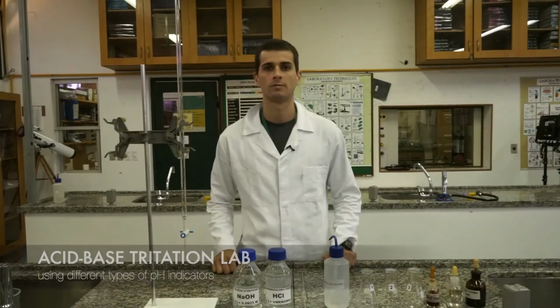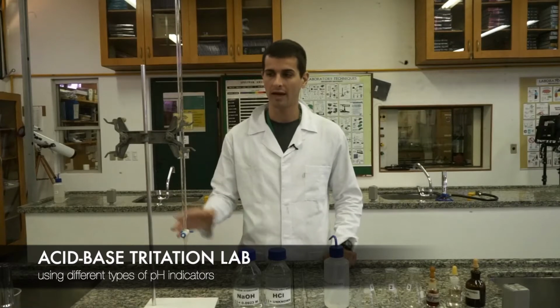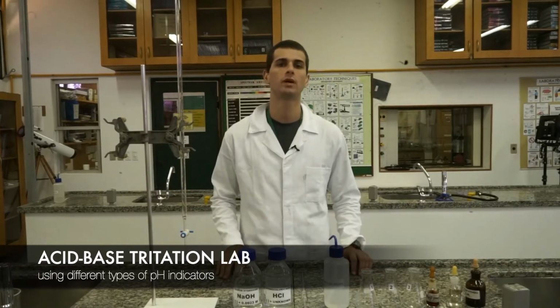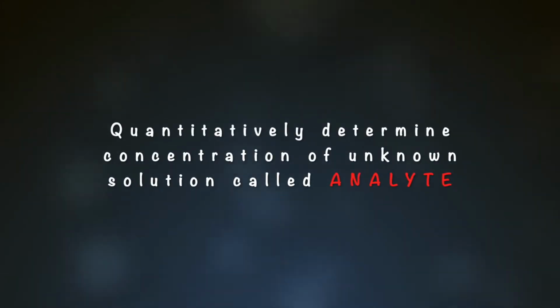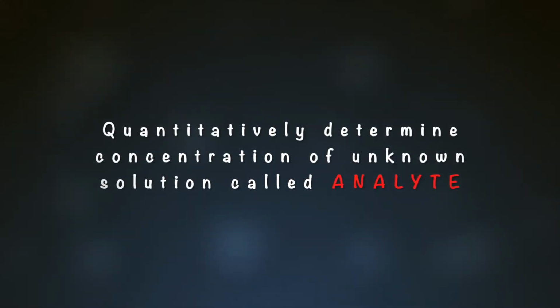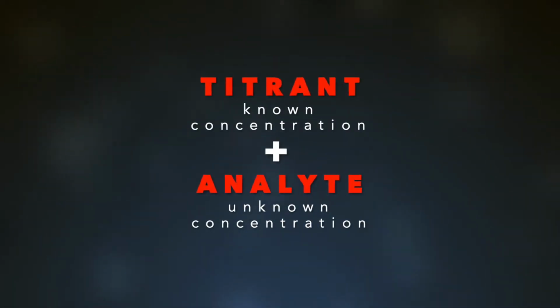Hello juniors! In today's lab, I will show you how to perform an acid-base titration using three different types of pH indicators. The purpose of titration is to quantitatively determine the concentration of an unknown solution, commonly called ANALYTE, by adding a volume of a chemical with a known concentration called TITRANT.